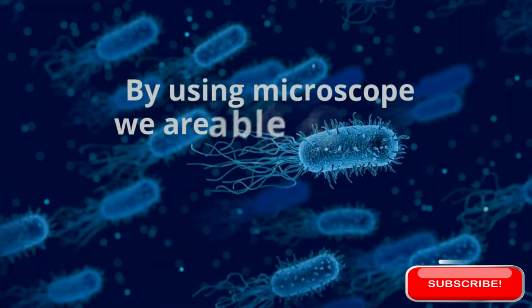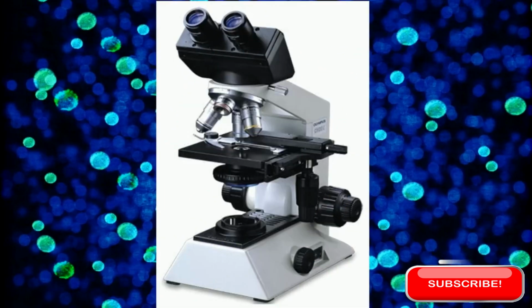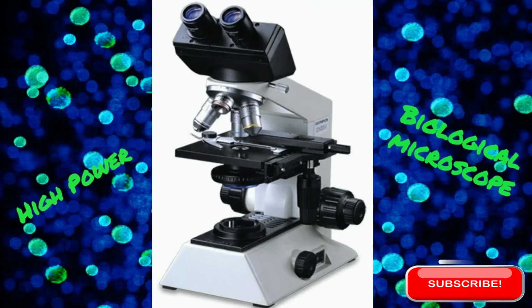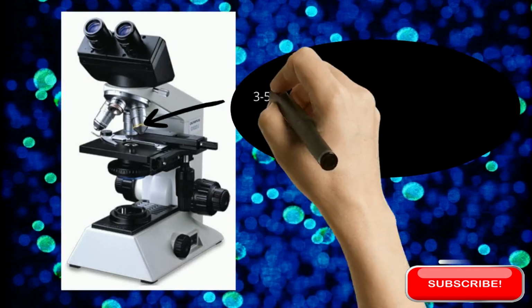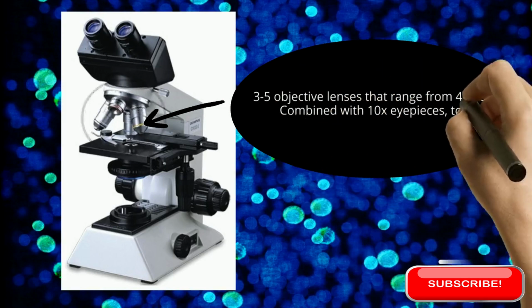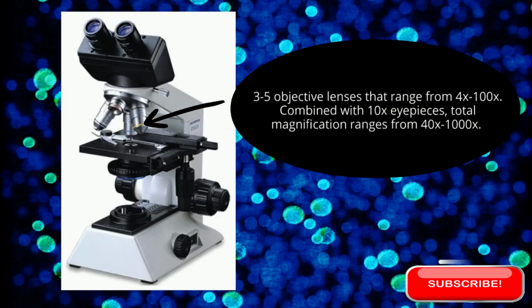By using a microscope, we are able to see the tiny organisms. Compound microscope, also known as high power or biological microscope, is used to view specimens not visible to the naked eye, such as blood cells and microorganisms. A compound microscope typically includes 3 to 5 objective lenses that range from 4 times to 100 times, combined with 10 times eyepieces. Total magnification ranges from 40 times to 1,000 times.